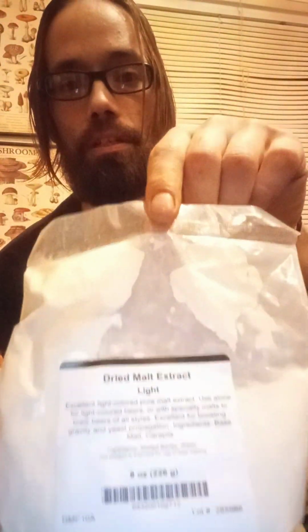Probably my least favorite supplement. Not that there's anything wrong with it. Sorry, I'm going to get a drink. Not that there's anything wrong with it, but when I first started growing, this is what the easiest recipe was. You know, LME, agar. I mean, you can make media like that. You can add yeast to that. You can add the 0.1 of the peptone. You can do any number of things. But I just never really liked the response with this.